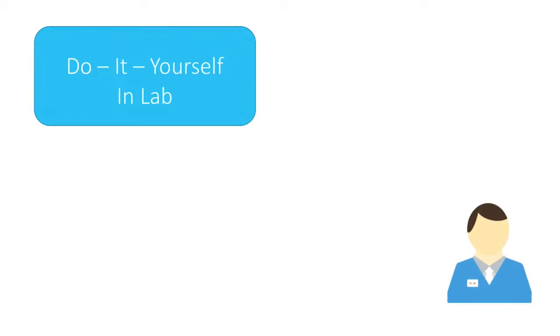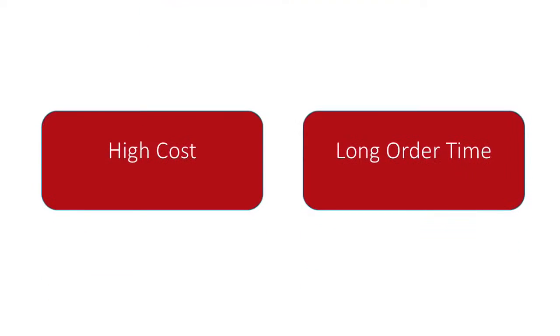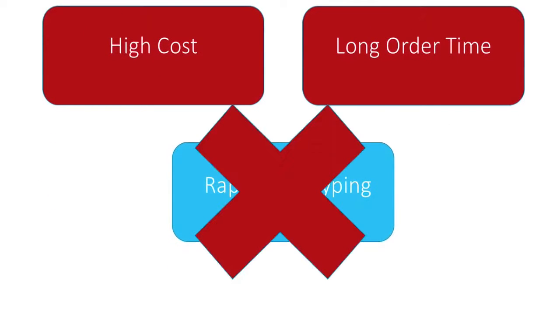What about ordering a chip? Doing some research, Dr. Ali finds that most manufacturers retail chips at very high costs, averaging at several $100s per batch. Worse off, these chips can take several weeks to be made and shipped to order. This makes experimentation through rapid prototyping nearly impossible.